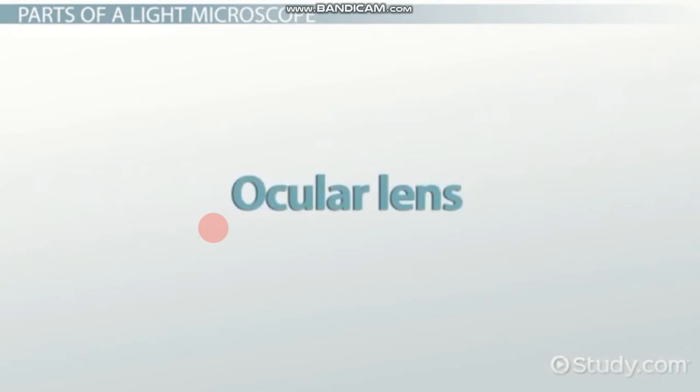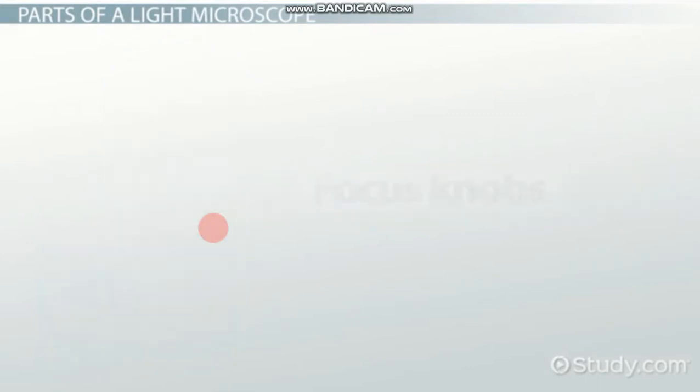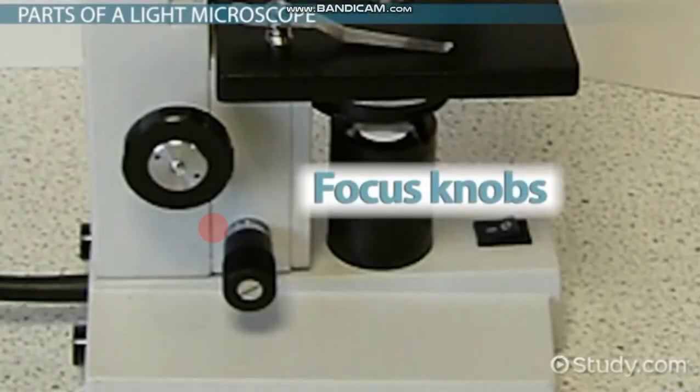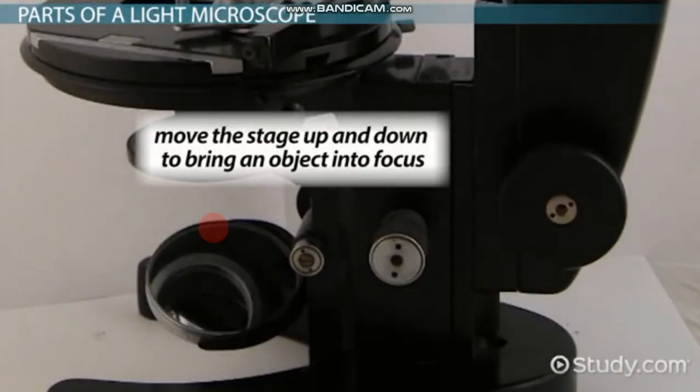The ocular lens is also called the eyepiece. This is the final lens and magnification step before the image reaches the user. Focus knobs generally include coarse and fine adjustment knobs. These move the stage up and down to bring an object into focus.